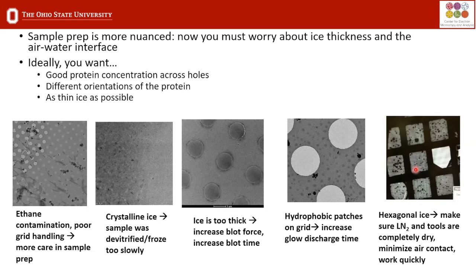When your tweezers are under liquid, they get super cold. When you take them out and leave them on the bench, they're cold enough that water vapor from the air is going to condense on your tweezers. So if you dunk them in your liquid nitrogen again without thoroughly drying them off, you're going to see a lot of this type of contamination.